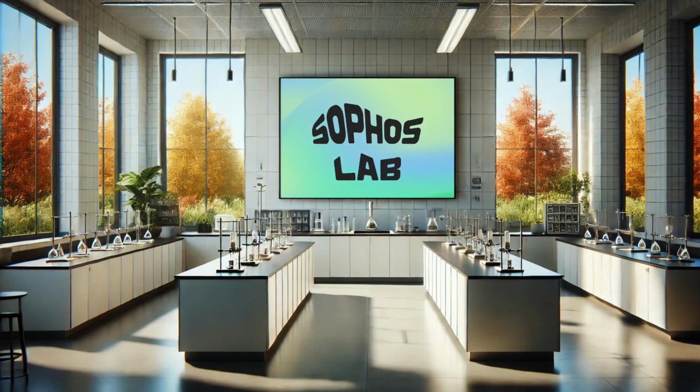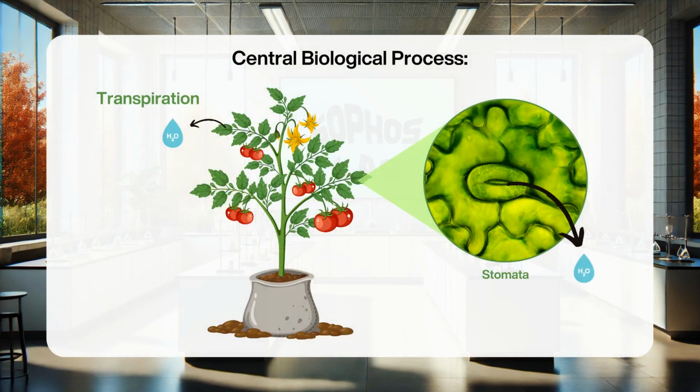Once you have completed the repetitions with different independent variables, we can analyze our results. The central biological process we are investigating is transpiration, which is the loss of water vapor from the aerial parts of plants, primarily through small openings in the leaves called stomata. Transpiration plays a crucial role in the movement of water and nutrients from the roots to the leaves and helps in cooling the plant.